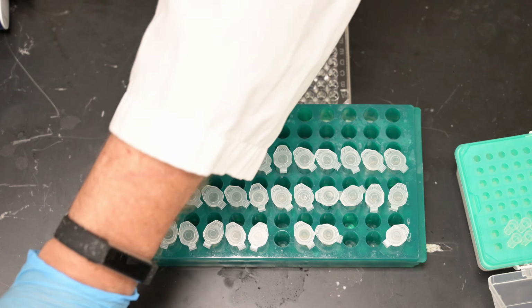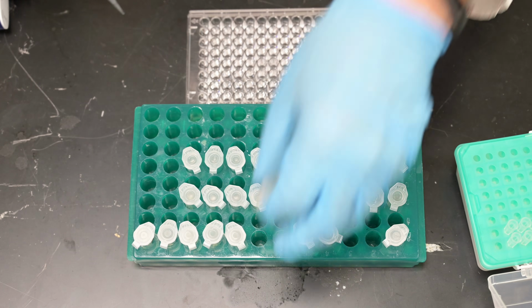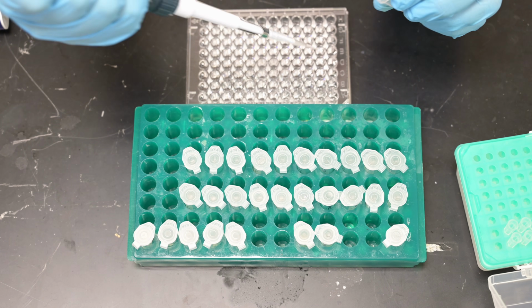Get rid of the tips, it's a different sample. Now I'll go to the 0.5. I mean the 1 mg per mil. Take 25 microliters out.